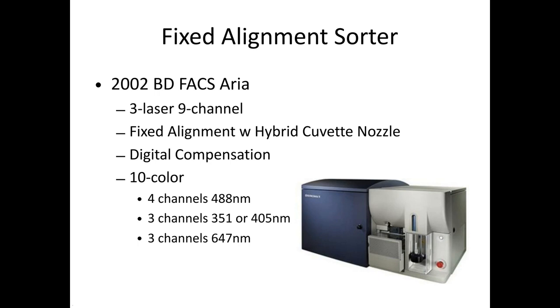And BD, in their own way, acknowledged it by making a change to the design, but they never really acknowledged that, yes, I had seen something. They tried to say it was my fault and blah, blah, blah, but they, behind the scenes, slowly changed the design. And the machine didn't have that problem as much anymore, but there was still something there. And it took an extra level of kind of experimental design introspection to make sure you weren't sorting your stuff at too high a pressure. Okay, so this was awesome.